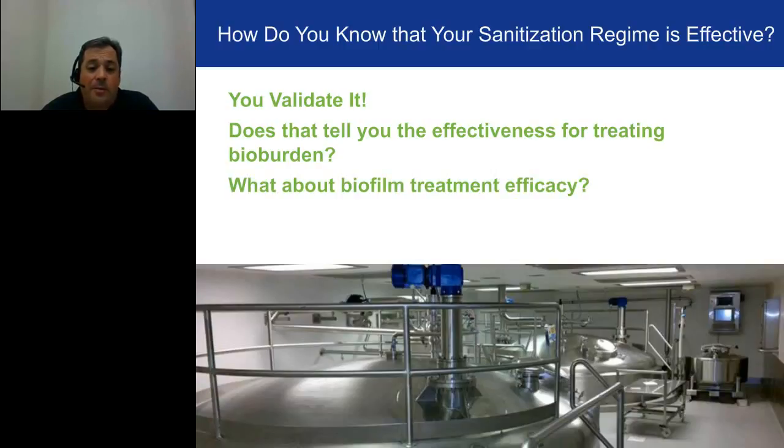And if it's a problem for bioburden in general, what do you think it tells us about the effectiveness of biofilm treatment? Well, we're not even looking at the surfaces. Typically, we're just looking at what's happening in solution. So you can imagine there's some holes there. So those of you who put validation had the correct answer as it is today.